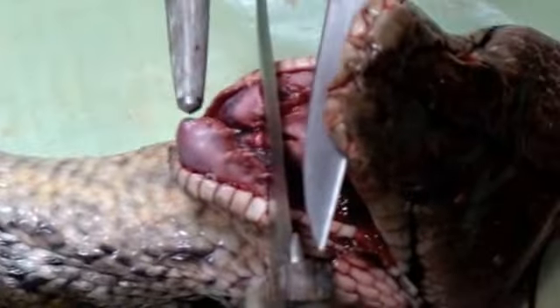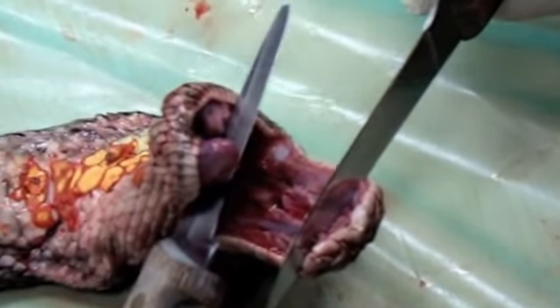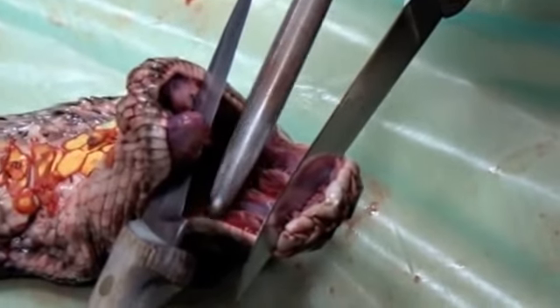Okay, and the lower jaw, see how it's two pieces? It can open up, and that's one of the ways he can get a bigger animal. And then this jaw joint right here will open up as well. Okay, so do we have something we can stick in there and leave it open? I need a dowel or... I don't have anything that small.